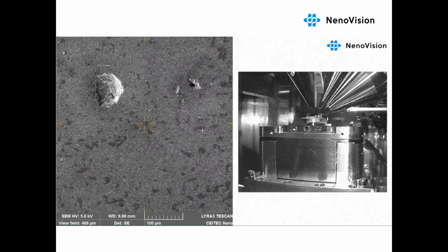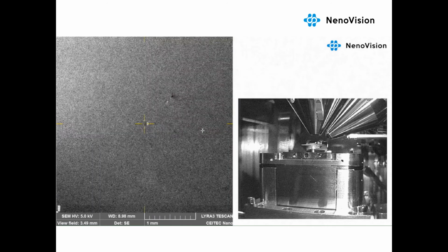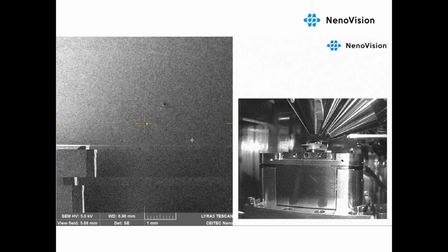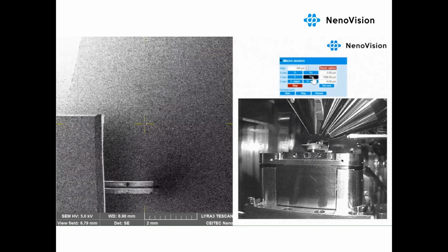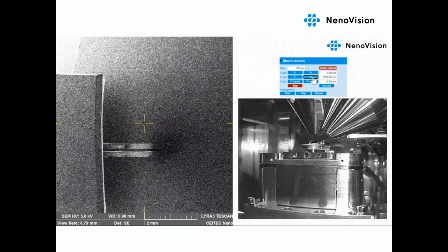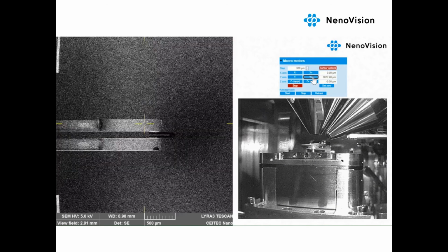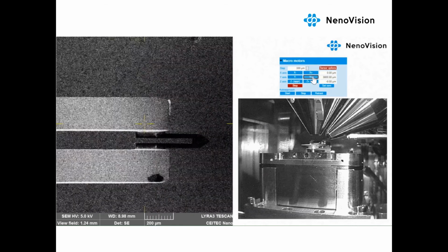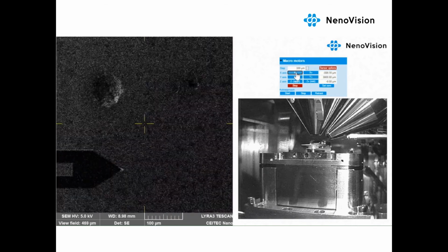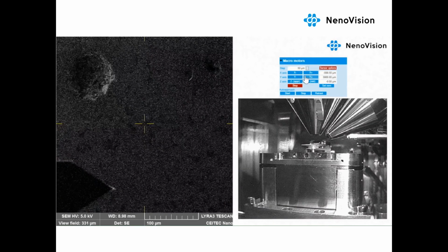We are going to use the macromotors box. Here shown on the right, we set the step value and move the tip according to this step in all X, Y, Z directions. To move finer, we decrease the step value and continue moving the tip.